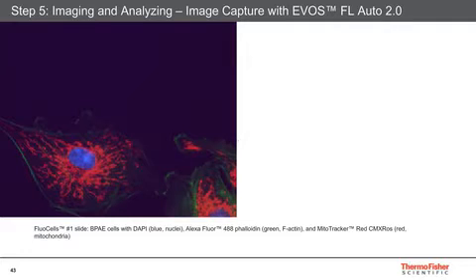For instance, there's a little bit of blue haze in the background, and that's because the gain setting was too high in the blue. In the green, it's actually quite dim. This is because I allowed it to photobleach too much. Now it's very dim. I didn't properly use an antifade. And in the red, I've actually oversaturated it with too long of an exposure time.